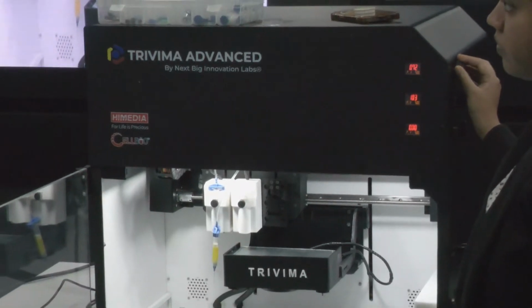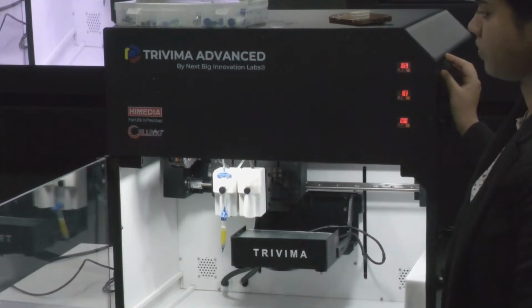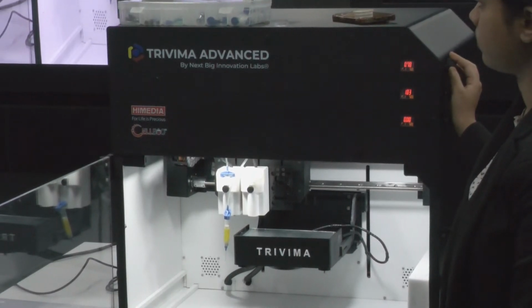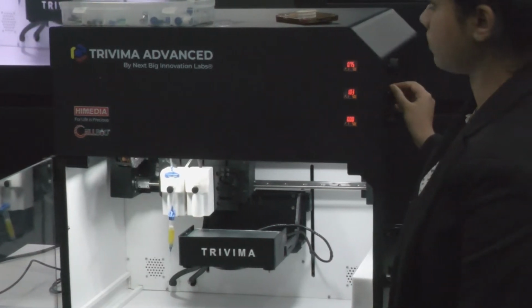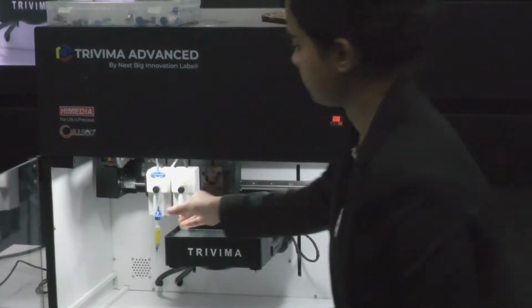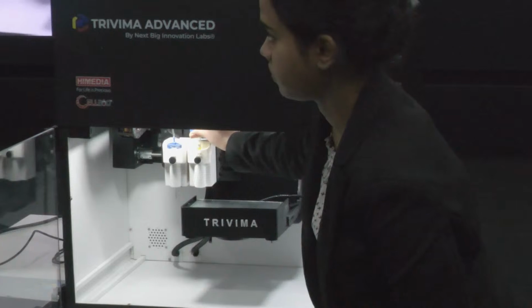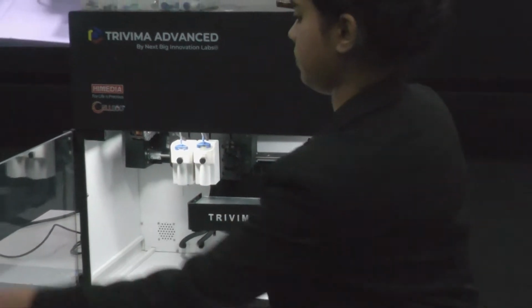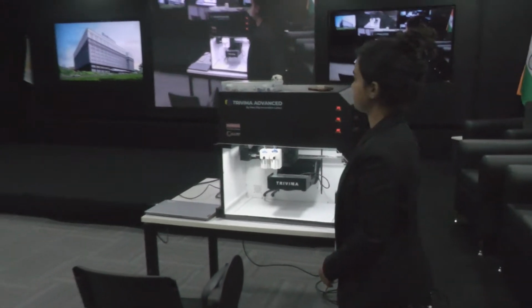So this is called extrusion-based bioprinting, where you're extruding with the help of compressed air, and you can control the extrusion rate, flow rate, and everything. Another form of bioprinting is called inkjet-based bioprinting. Now, in inkjet-based bioprinting, the syringe setup that you see here is much more compact. There we have a piezoelectric element attached to it.